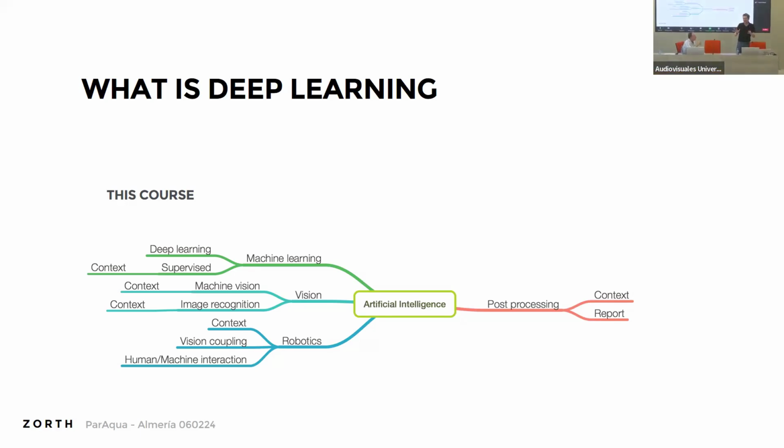Example: I can take a microscopic image of asbestos fibers and feed it through a model that measures spirulina. And the spirulina model will tell me that there is spirulina in my pictures of asbestos fibers. There's no context. The context is something that you give to the model using metadata. And it's something that we're going to look at.